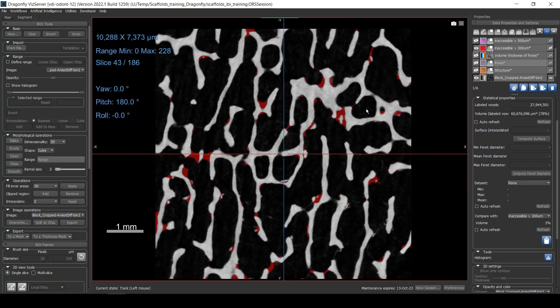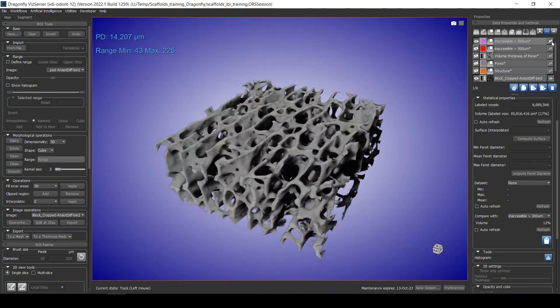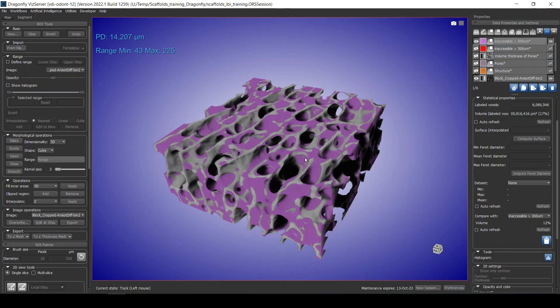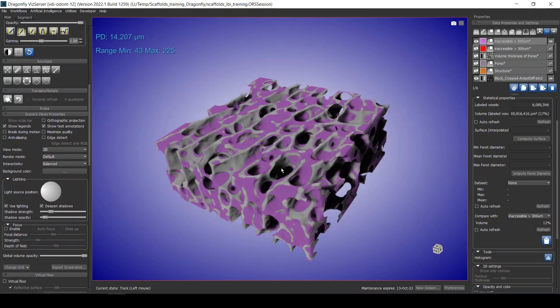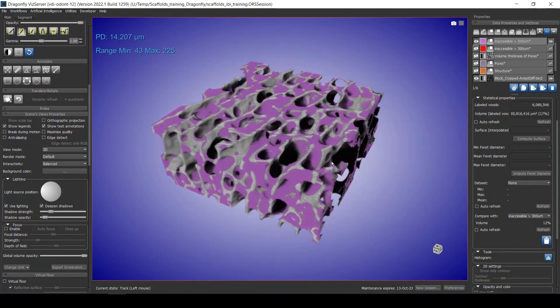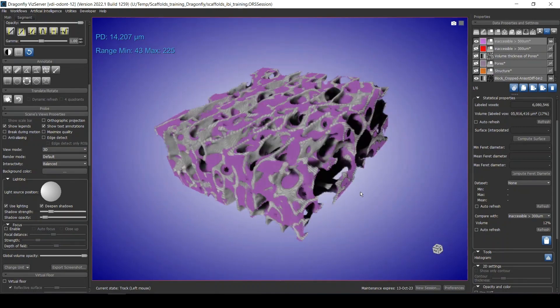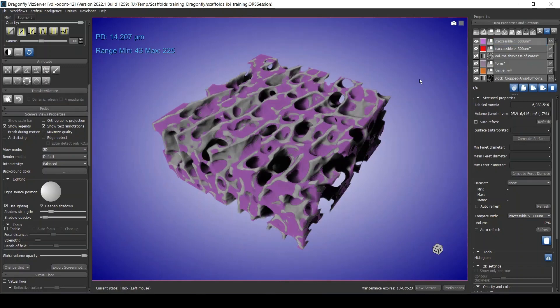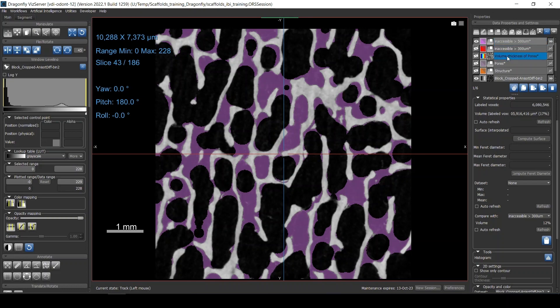And if you need the exact numbers you can just copy them from here. Let me also show the 500-micrometer inaccessible region in 3D — this is how the non-accessible pore space looks for anything greater than 500 micrometers.